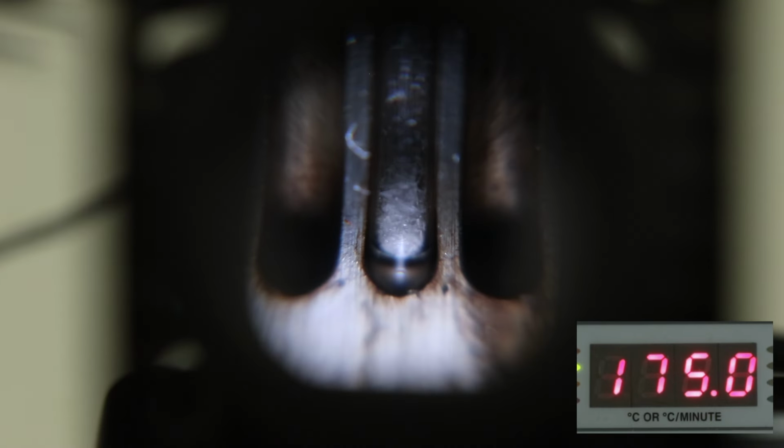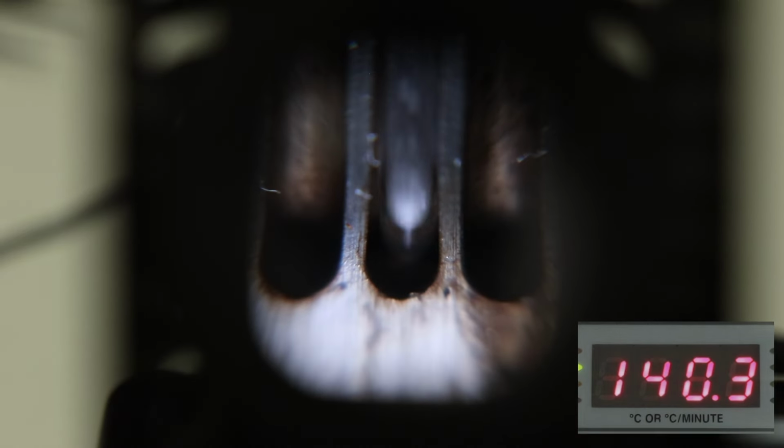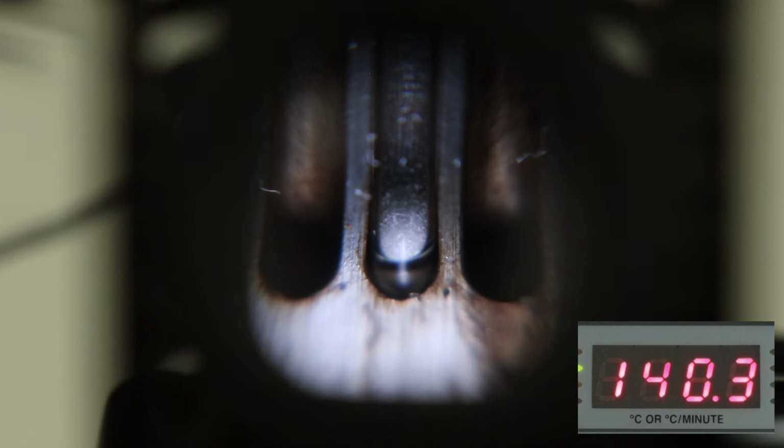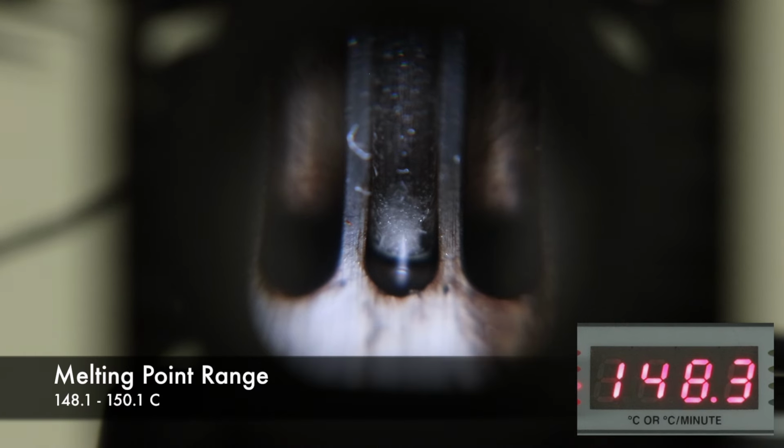I first put them in around 175 degrees and they melted instantly. So then I put them in around 140 and nothing really happened. So I'm going to go ahead and start ramping up the temperature to see if I can get their melting point. And it looks like everything started melting around 148.1 degrees Celsius and finished around 150.1.